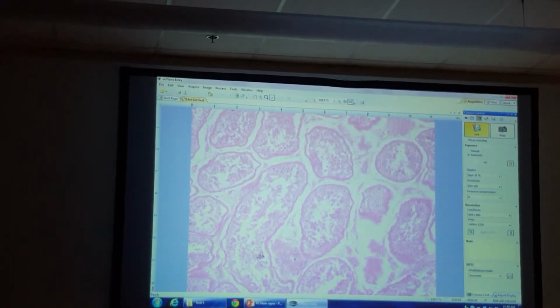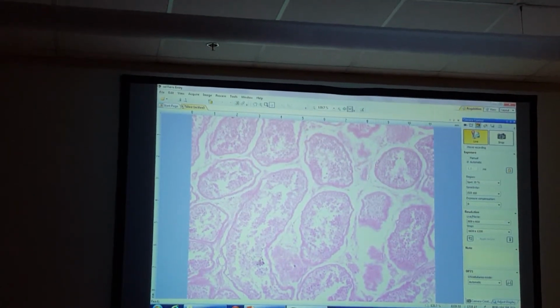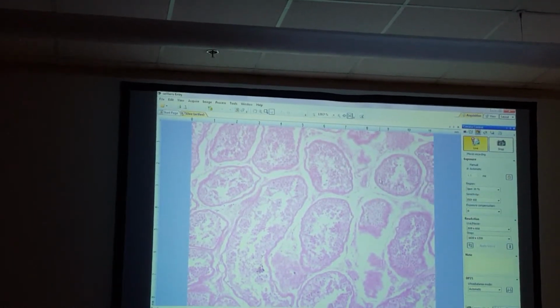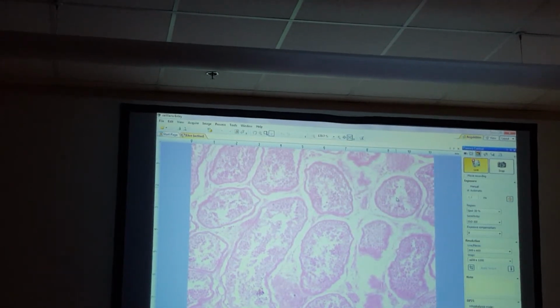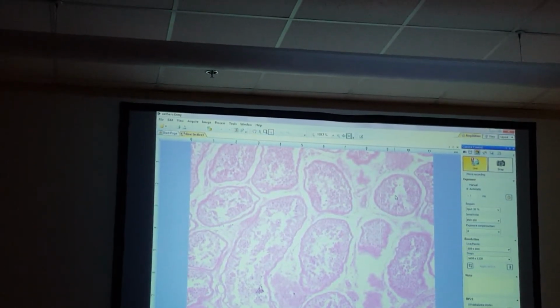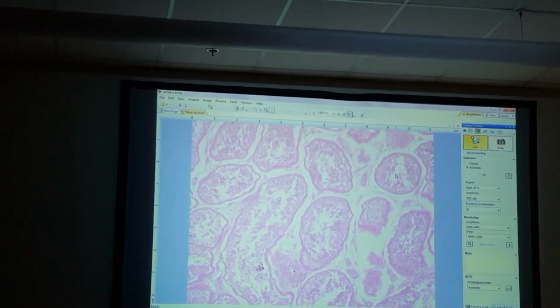These cells out here would be interstitial cells of Leydig making testosterone. Putting it together with the lecture today, if this were my seminiferous tubule, spermatogonia would be out here at the edge of that tubule. Then the spermatogonia would change into a primary spermatocyte, secondary spermatocyte, spermatid, and release sperm into the lumen. As you think about development, it's moving toward the lumen as it produces the final product of sperm. From spermatid, did you go to spermatozoa? Sperm and spermatozoa mean the same thing. Everybody okay with that slide?